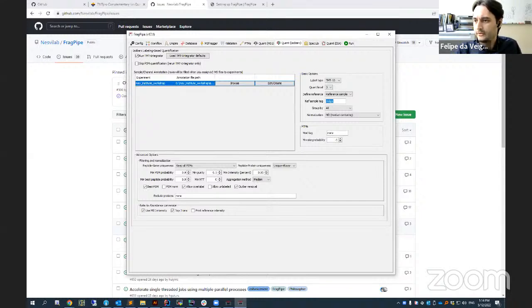Is this tutorial dataset available on the GitHub? No, it's not on the GitHub, but if you go to the May Institute website on the program listing, right next to this session, you're going to see a link called Docs. We added the links for all the programs and to the dataset on there, so you can find it there.